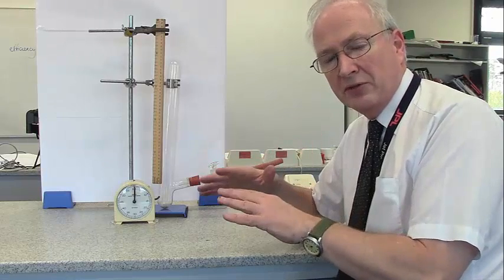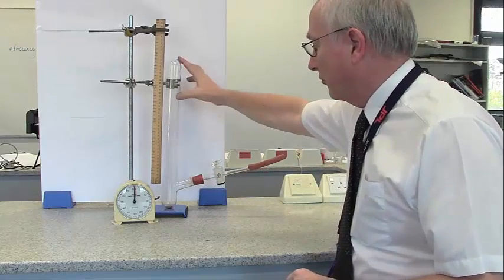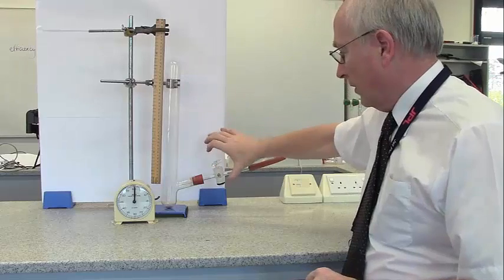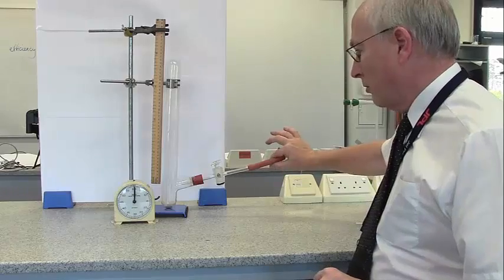So we're going to find out, and we're actually going to measure the speed. The apparatus is a glass cylinder which is sealed. I've got a valve which I can open. It's close to the bottom, leading into it. And I'm going to put some bromine here.